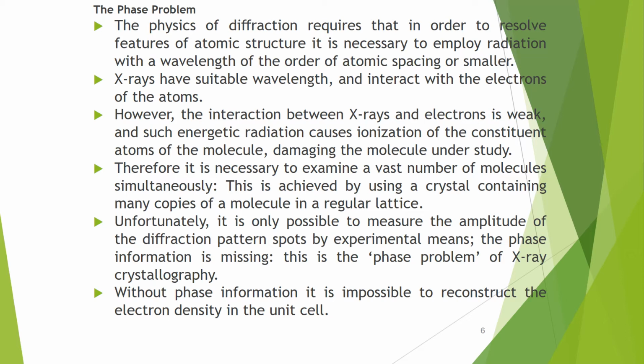Therefore, it is necessary to examine a vast number of molecules simultaneously. This is achieved by using a crystal containing many copies of the molecules in a regular lattice. Unfortunately, it is only possible to measure the amplitude of the diffraction pattern spots by experimental means.